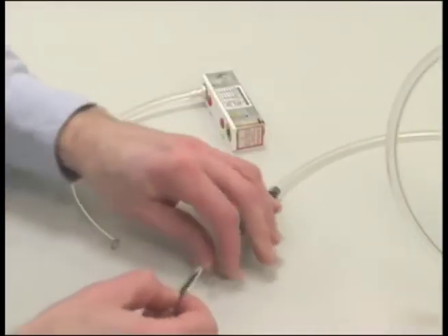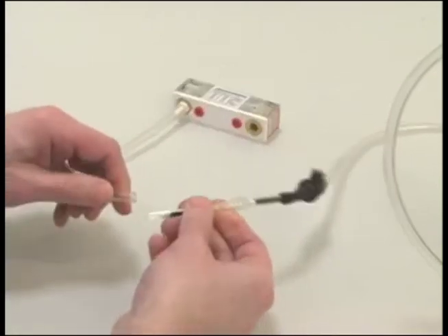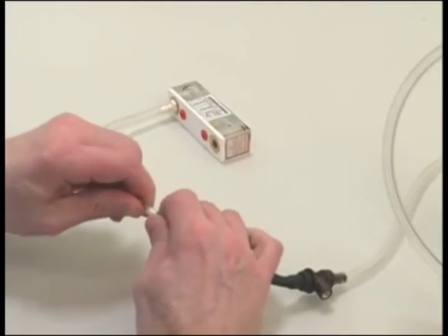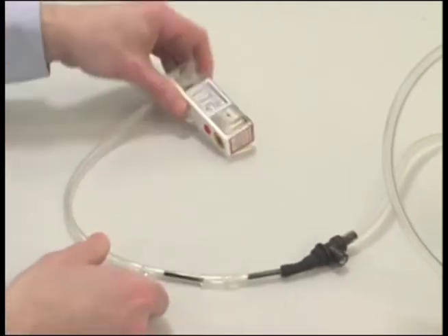Using a short length of tubing, connect the back sorbent tube to the front tube so that both tubes are oriented in the same direction, with arrows pointed toward the pump. Connect the rotometer to the exposed end of the back sorbent tube.